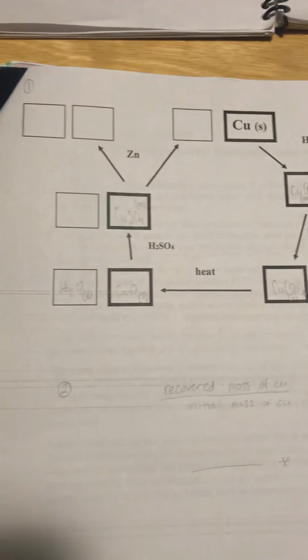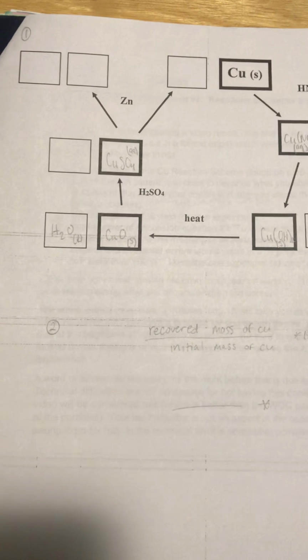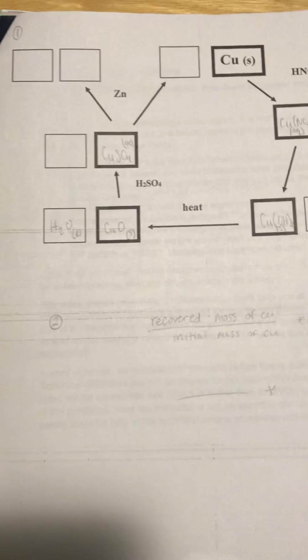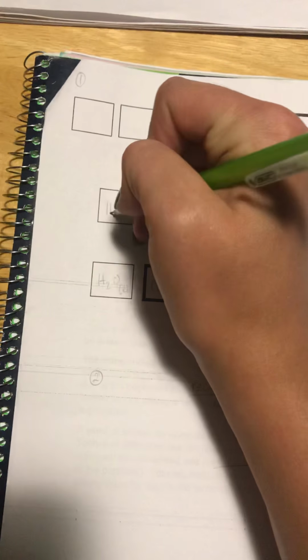Through this, there's no bubbling or anything, but you can see the color of the solution turn from a dark brown to a green to a dark green to a light green, all the way back to the bright blue that we had from the start. And of course we have H2O over here as a liquid, the colorless liquid.